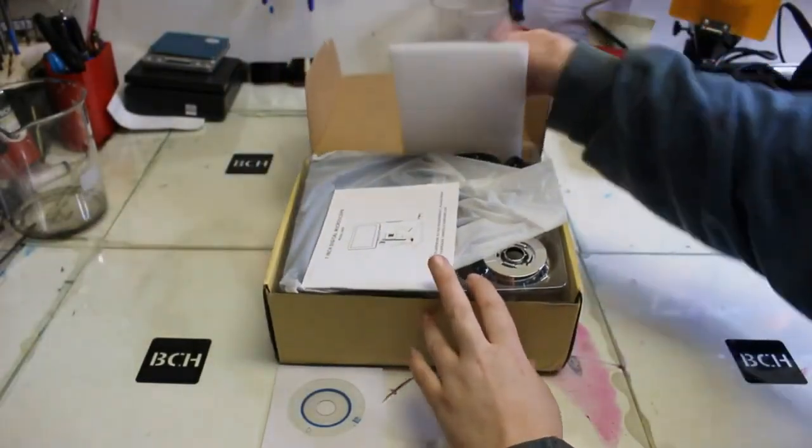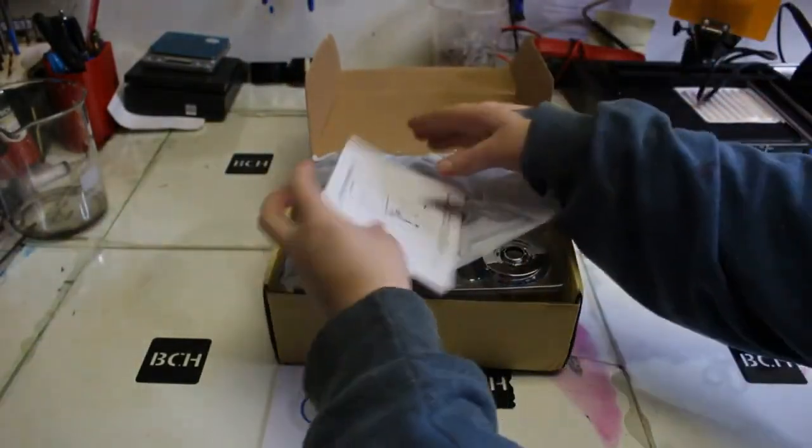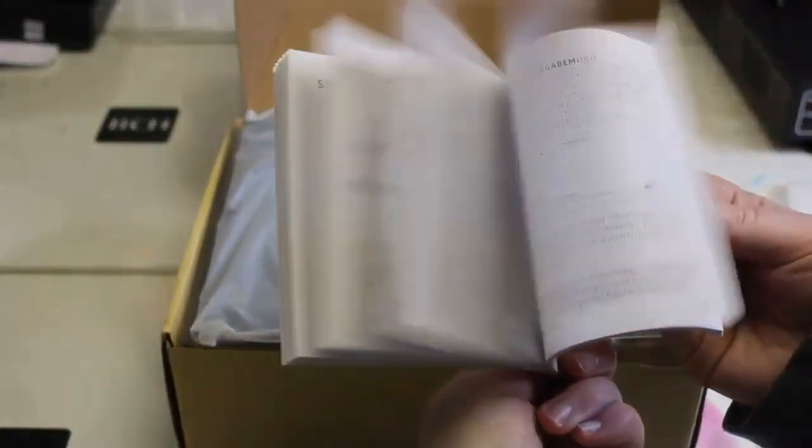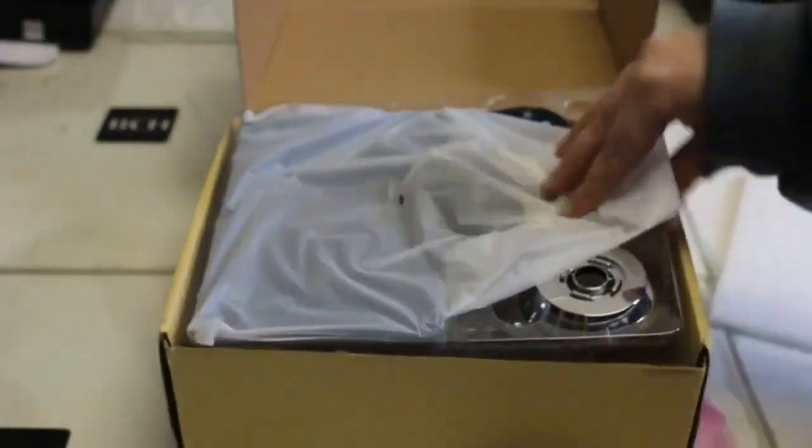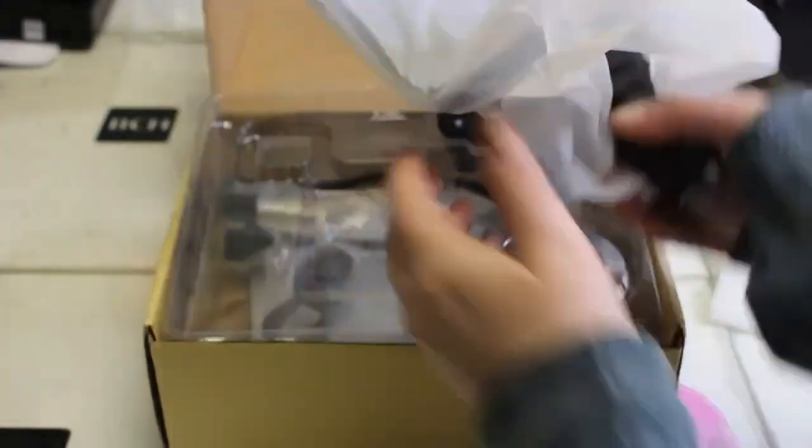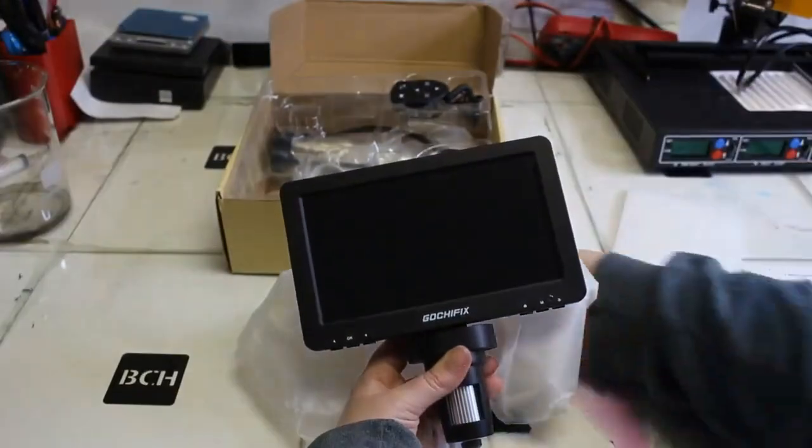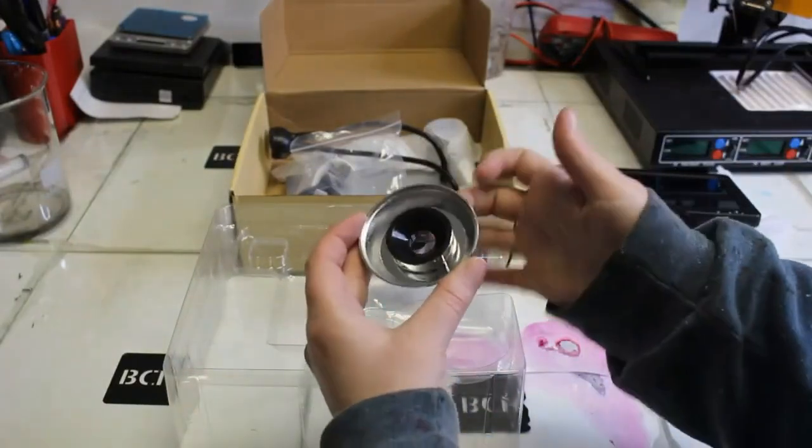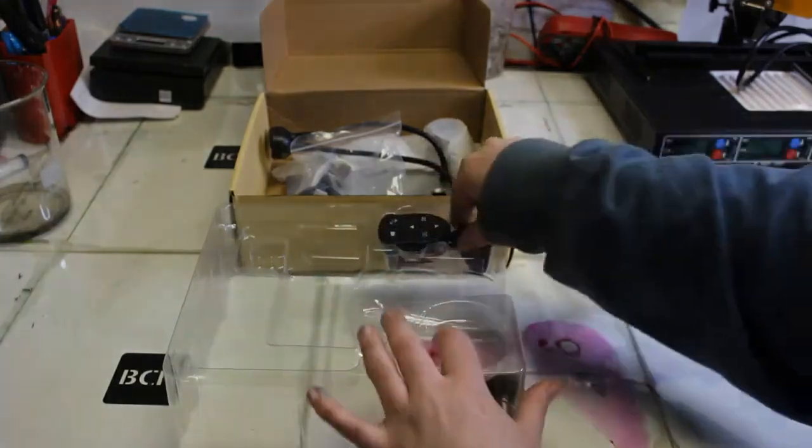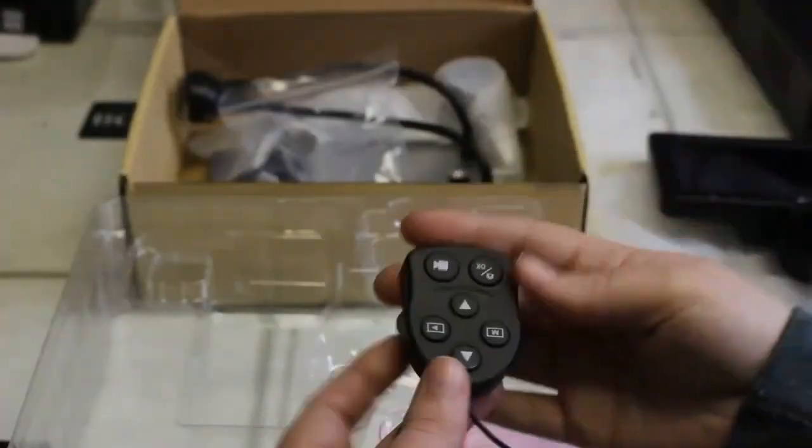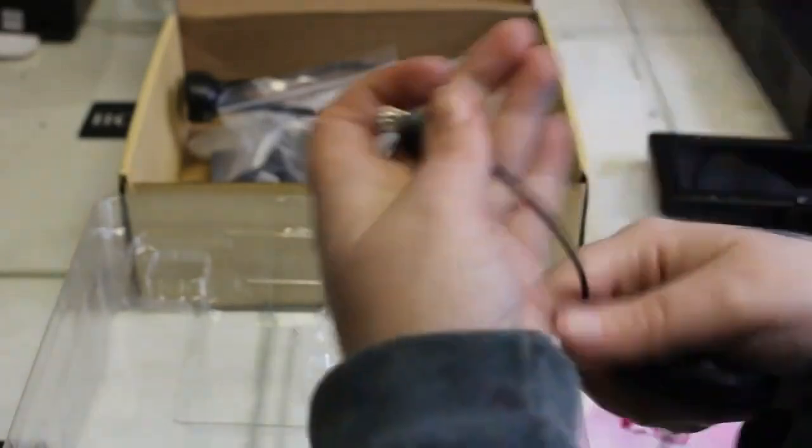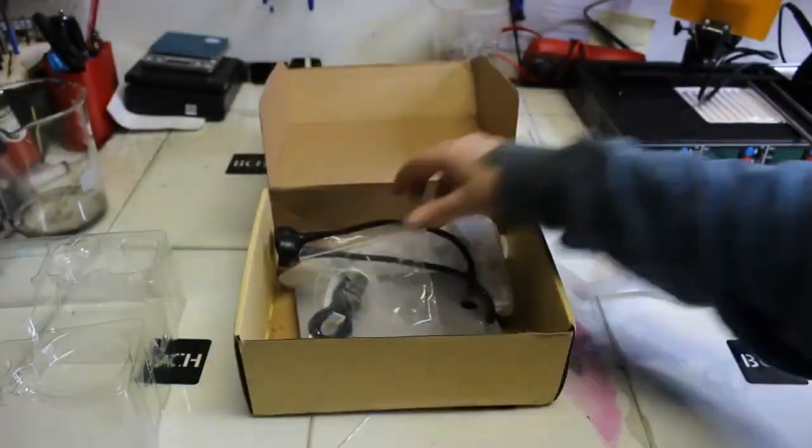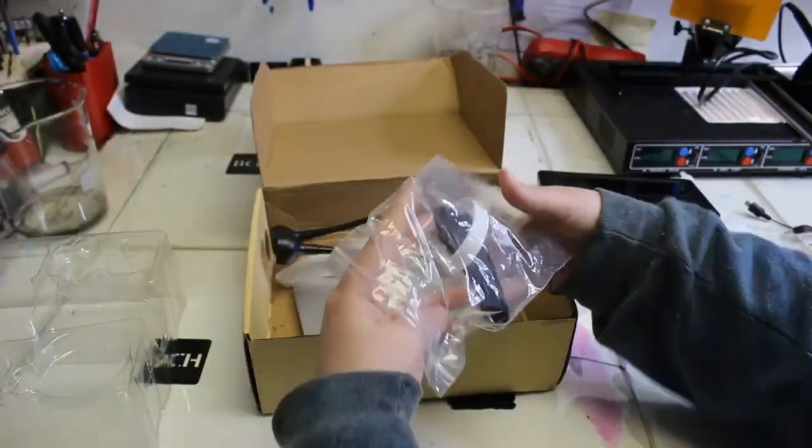I'm going to unbox it and we'll go over some of the things that I pulled out. There was a piece of styrofoam in there to help with packaging and here I have the guidebook which was pretty thick and it came with a little CD. Then we have the microscope screen that was packaged in a little soft bag to help keep from scratching the screen and we have a light shield here and then I have the remote to control the actual microscope.